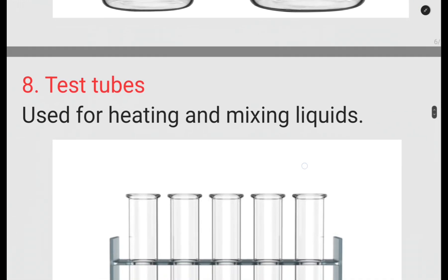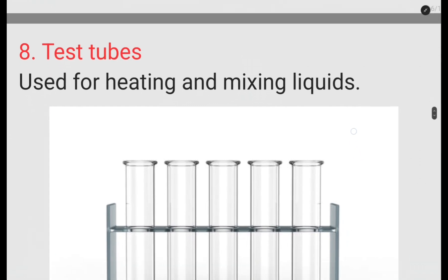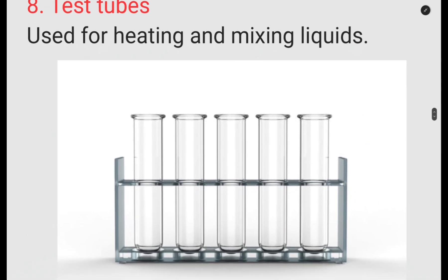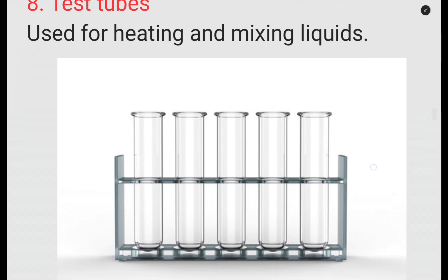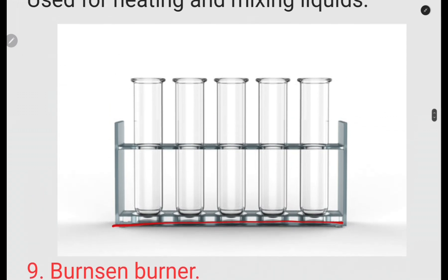Test tubes are used for heating and mixing. If you are going to carry out experiments in the laboratory — especially when it comes to testing for reducing sugars — you are going to use test tubes for heating and mixing liquids. These are held on the test tube rack.